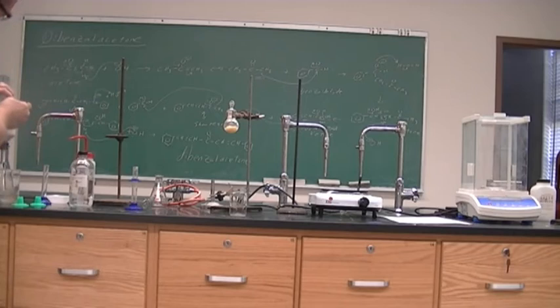We get a very fast crystallization. Our crystals are very, very small. If we would have done a slow cooling crystallization, we could have got some much nicer crystals. We're not looking for a crystal structure, so we have sufficient crystals for getting a good melting point.